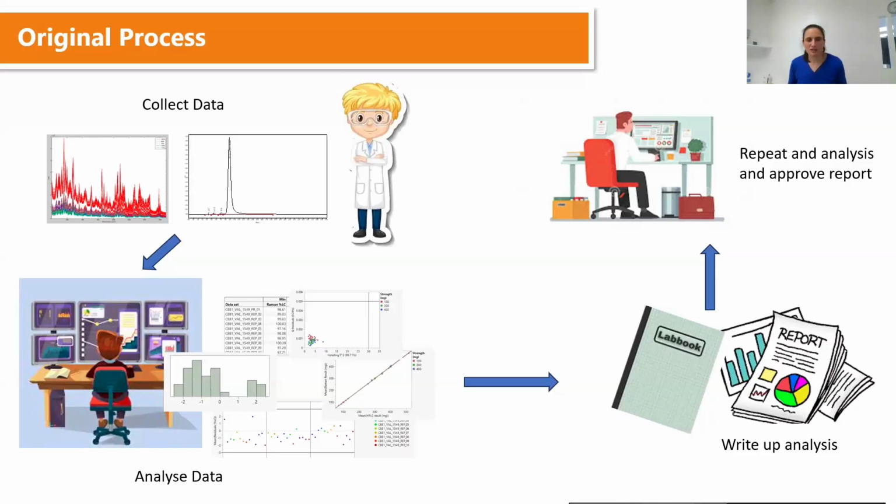I've then done the analysis. So I've concatenated tables together, done all the JMP setting, tabularized what I need to, and checked against all the acceptance criteria. Now, one of the things that our quality department has asked is that I make a note of every single step that I do in JMP. So I have to write in a notebook where I've concatenated, how I've subsetted, what results I've got, etc.